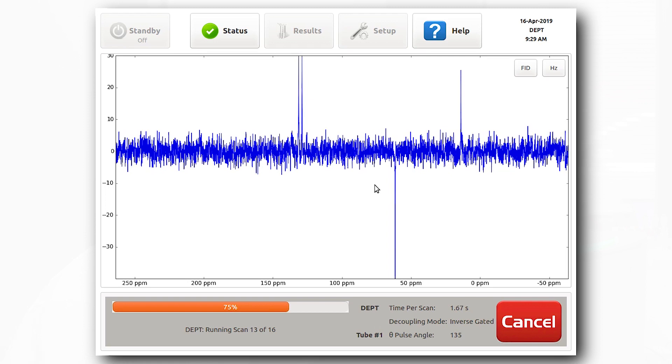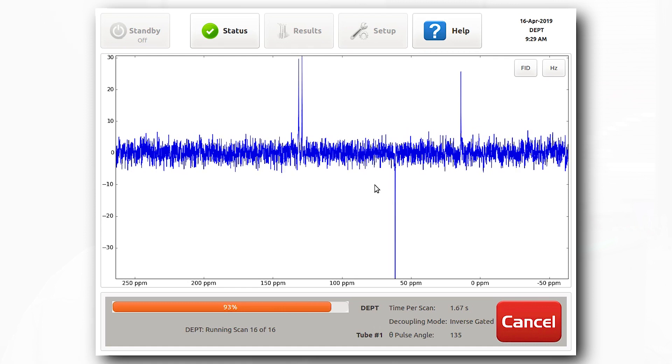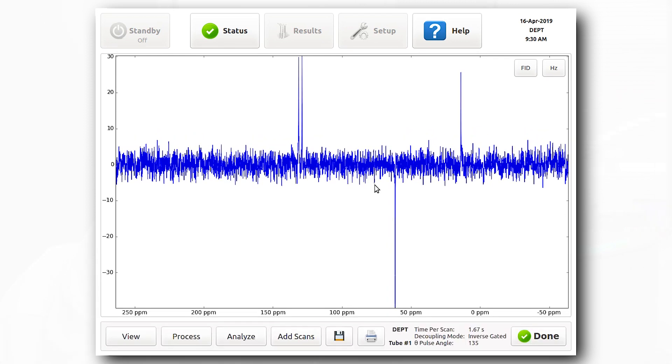In DEPT 45, all protonated carbon resonances will appear with positive intensities. In DEPT 90, only CH systems will appear. In this way, the number of protons attached to a carbon center can be easily deduced.